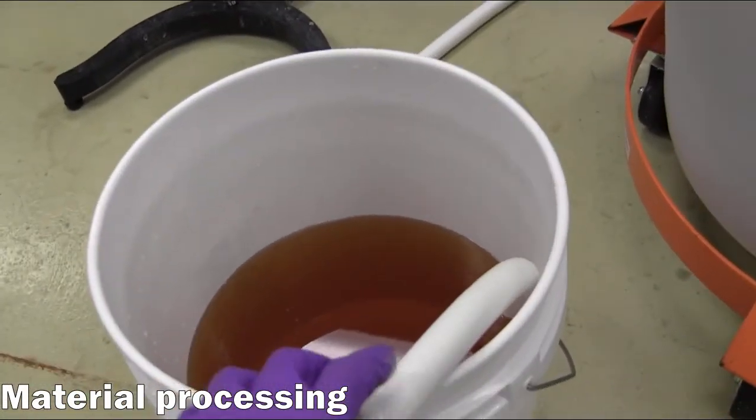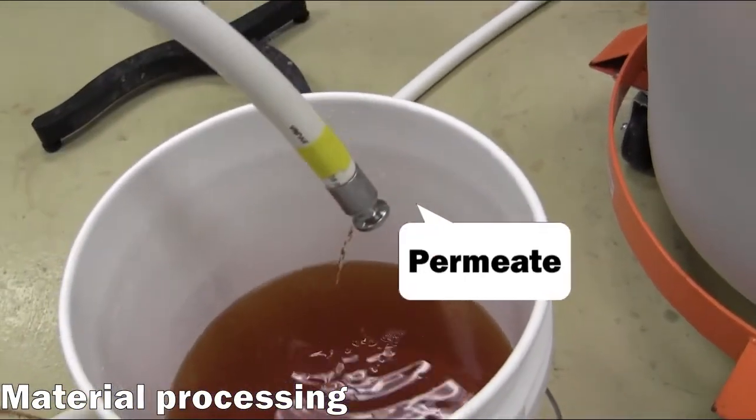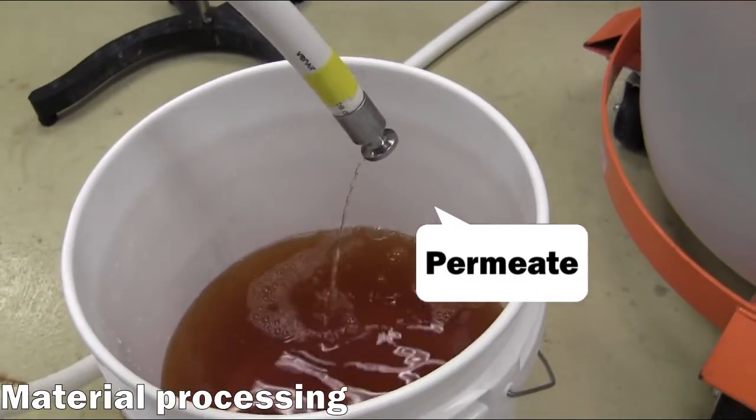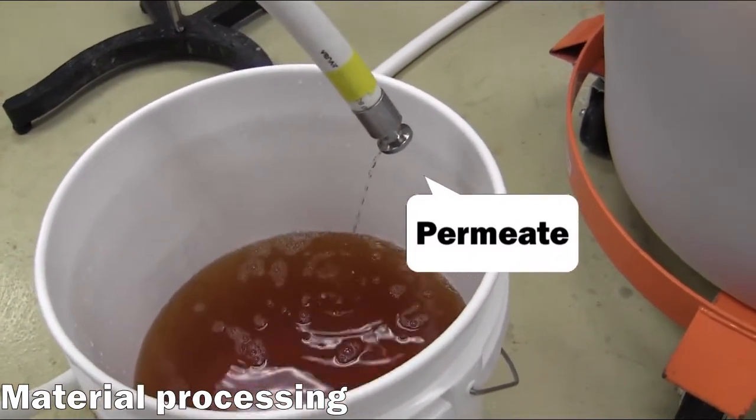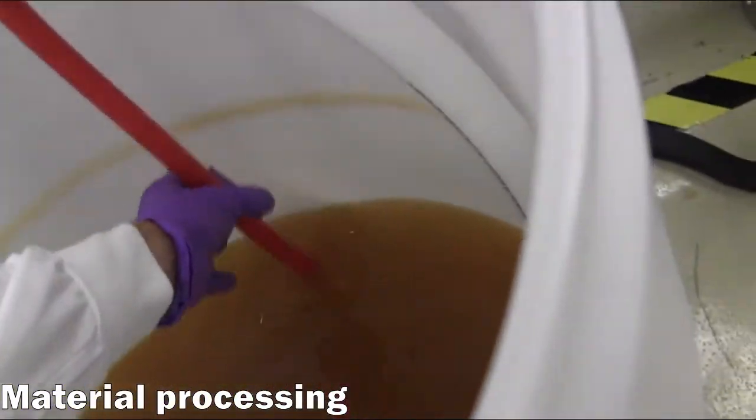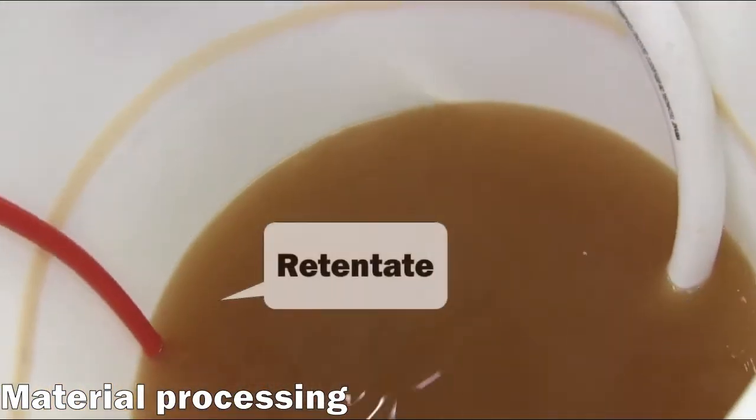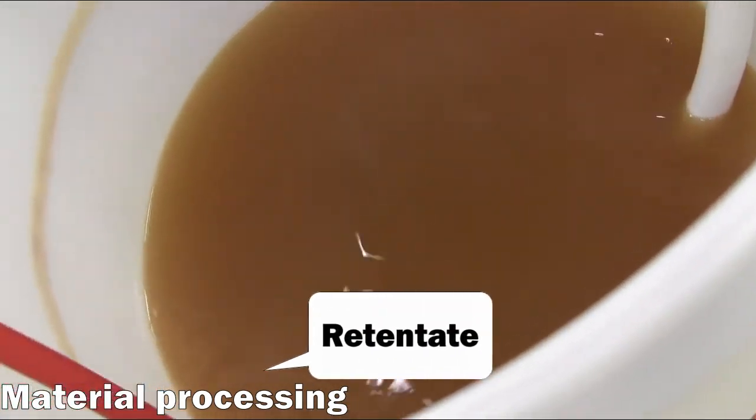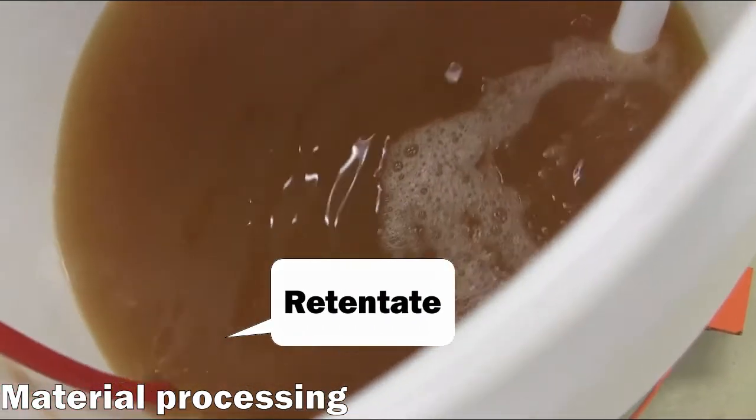The retentate hose is also placed in the vessel of input material, allowing the recirculation of unfiltered crossflow.